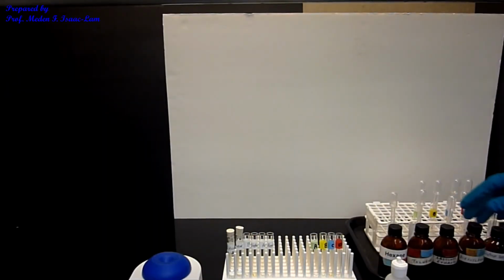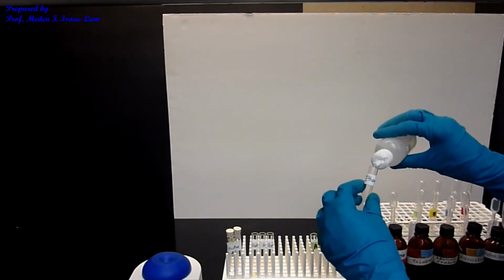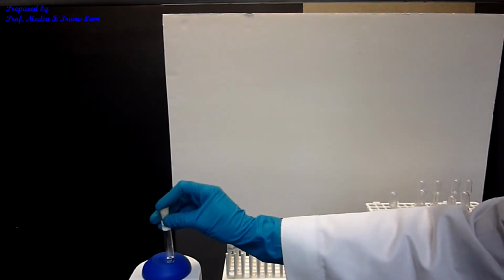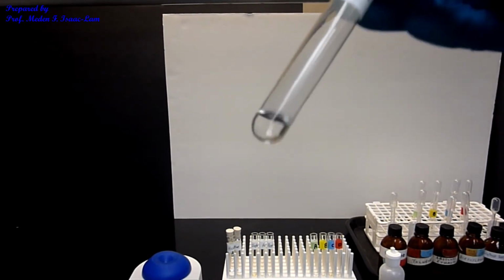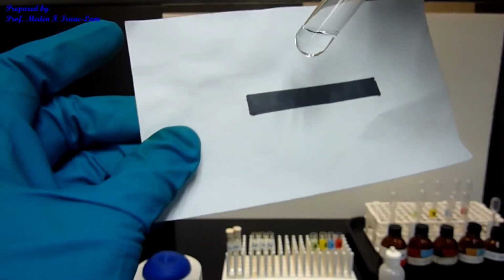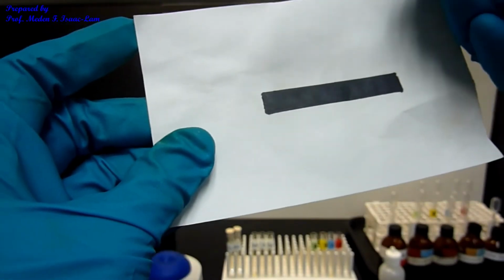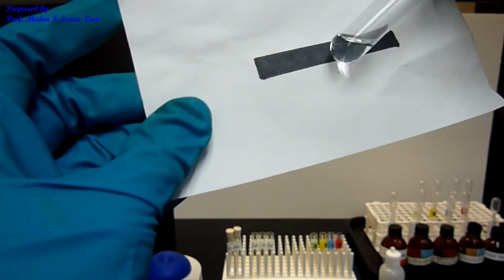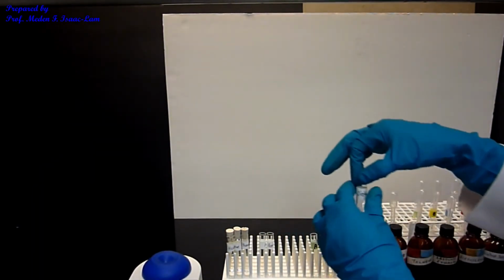Now I'm gonna do ethanol. So ethanol is this. So again, 8 drops. So I'm gonna mix it up, okay? And then again, so this is now ethanol. Okay, so I don't see any droplets on the side. A little bit, but not a lot, okay? Okay, so I don't see any layer either. Okay, that was ethanol. So now I'm doing diethylamine.